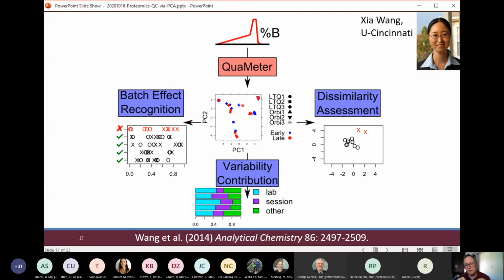And in some cases, we would like to be able to evaluate variability sources. What are the causes by which we have different results? A friend of mine recently sent some cell lysates to multiple proteomics facilities in South Africa to ask whether the data that came back were equally sensitive among these different facilities. So being able to discern not only is it higher or lower between these sites, but how reproducible were the values that came back from these data sets is important. Could it be that a technician with good hands used the instrument on this day and the trainee used it on the next day and isn't quite as experienced yet with how to make the instrument perform? It could be that the operator of the instrument can cause a difference in the data that come back.